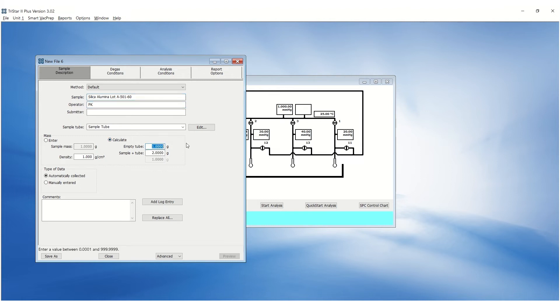Select Calculate, then enter the empty tube and after degas sample plus tube mass.